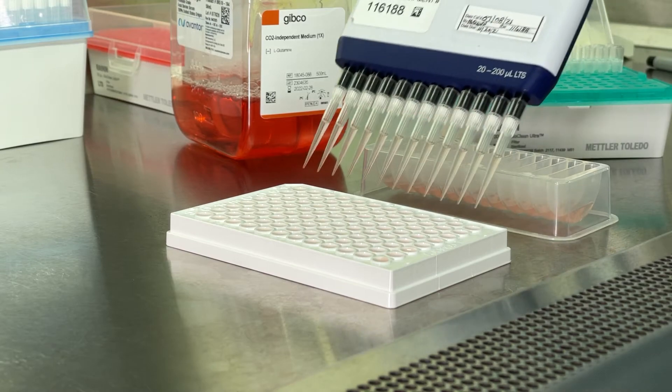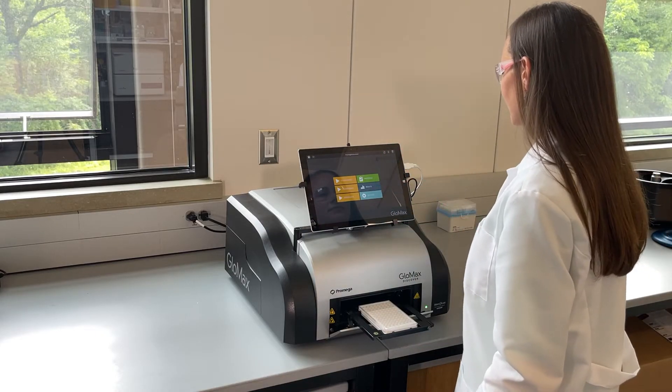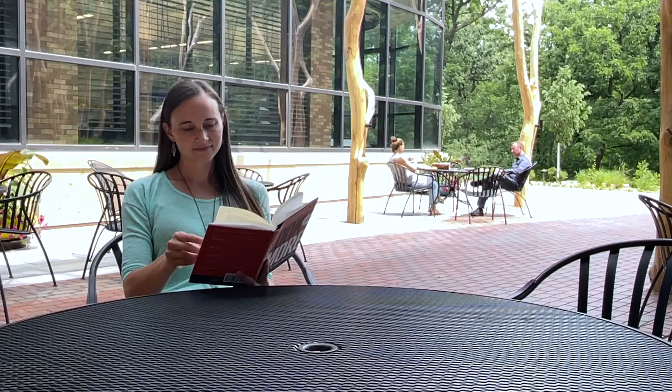Now that it's set up, I add the test compounds, place the plate in the instrument, and start the run. I can easily multitask now — I could head to a meeting or just relax with a cup of coffee, knowing the instrument is running great.